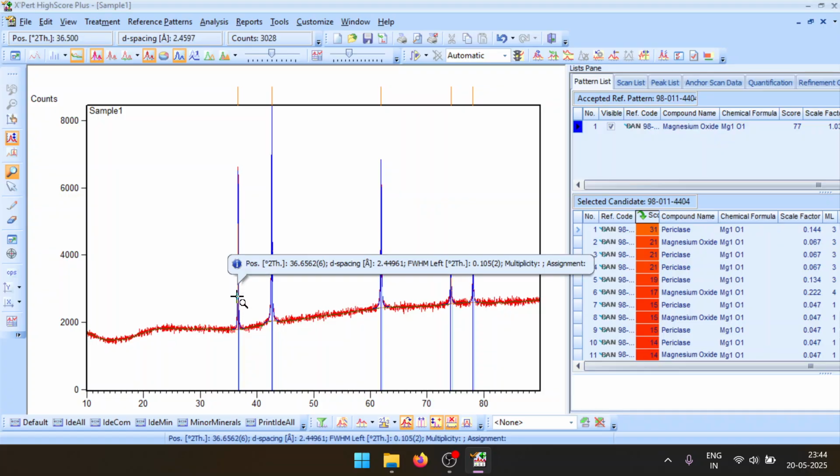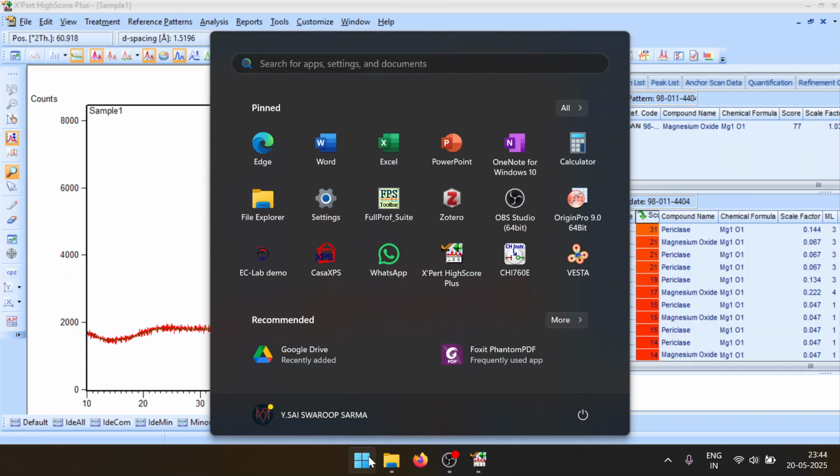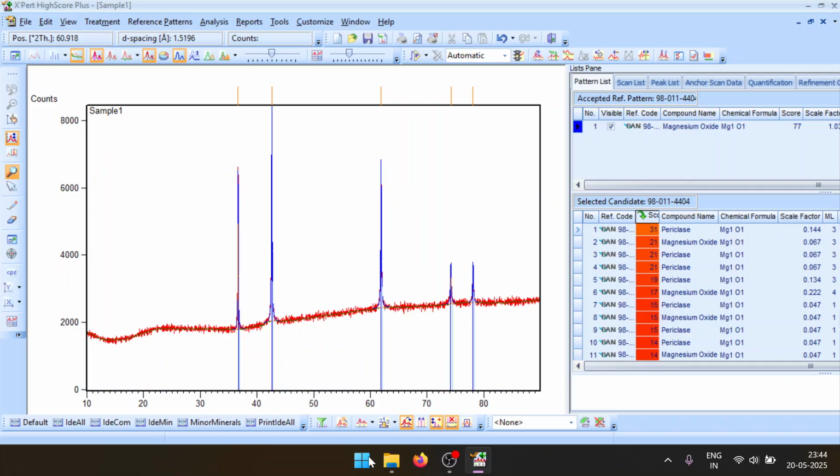You fit a mathematical model to your data, and there are many parameters in the mathematical model, a lot of them. Once there is a very good fit in the Rietveld, which means that you have mathematically fitted your pattern, whatever parameters appear in the mathematical formula or the model are the parameters of your material. So you can get to know A, B, C, and then all the stress, strain, atomic site fraction, and atom positions, everything you can fit.